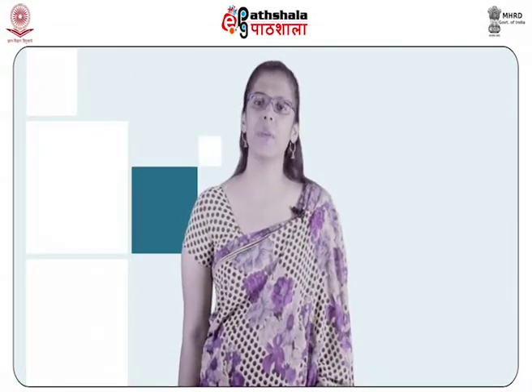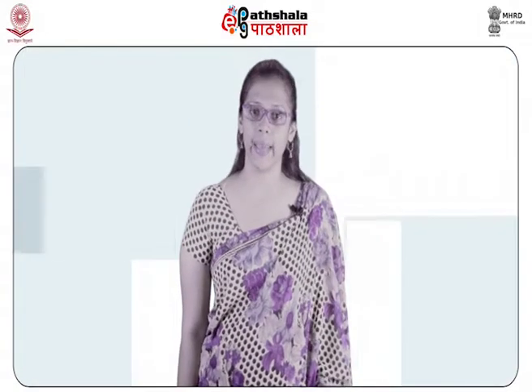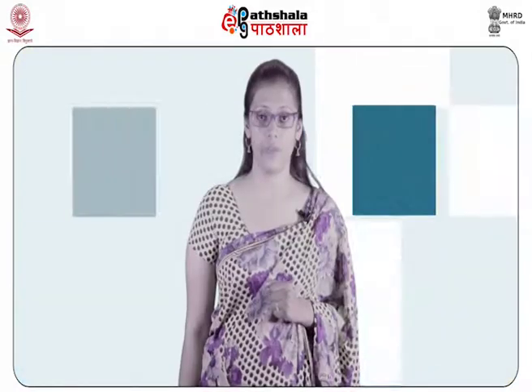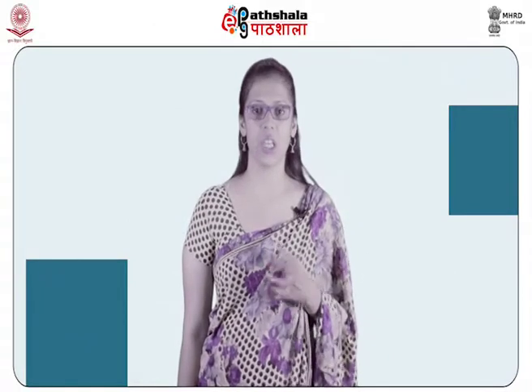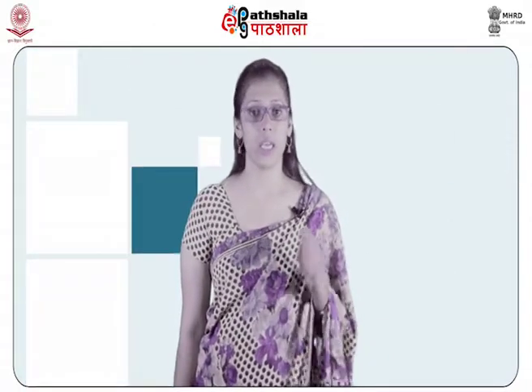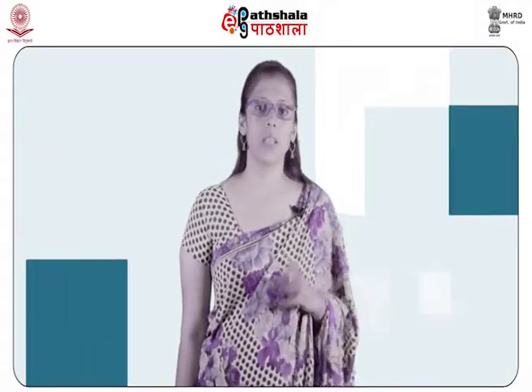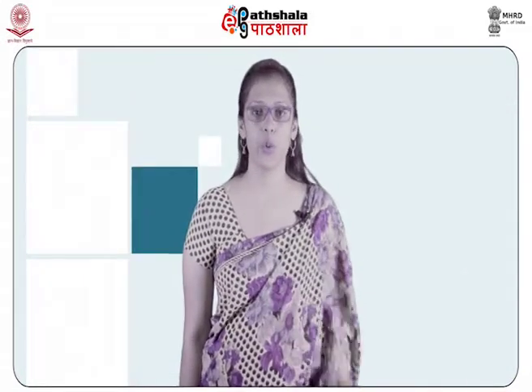A period of several months to years can diminish the significance of a head hair comparison, while some years may not seriously influence the significance of pubic hair comparison. When hairs originate from a body in a stage of decay, a black band may be seen near the root of the hair. This feature has been considered a post-mortem root band.